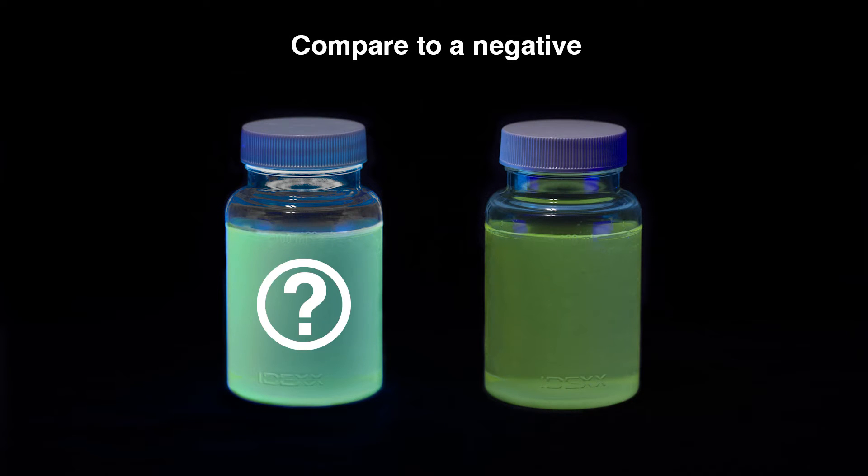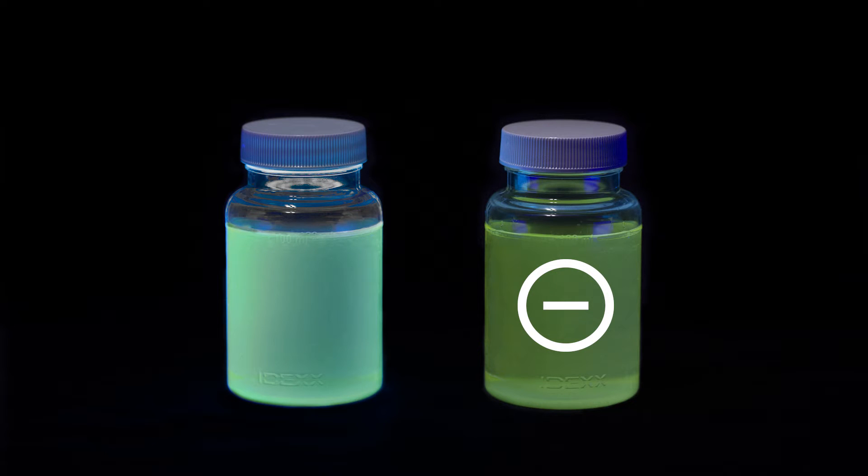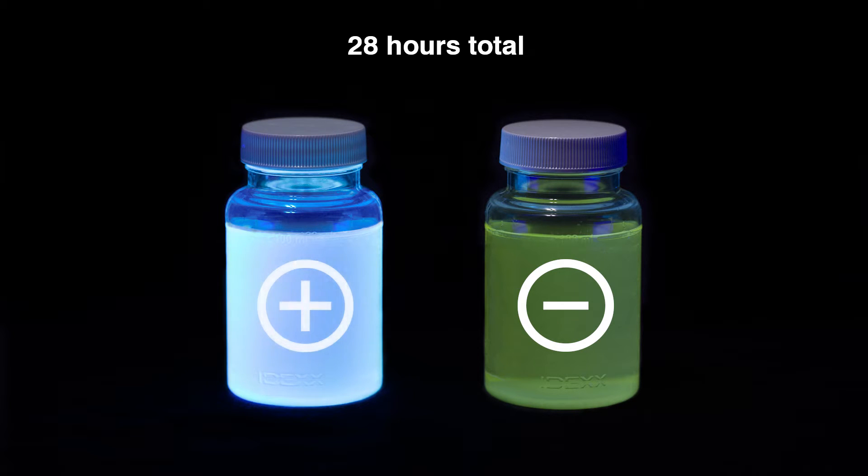If you're unsure whether a result is positive, compare the sample with a known negative. However, if the results are ambiguous based on the initial reading, incubate up to an additional 4 hours, but not to exceed 28 hours total, to allow the fluorescence to intensify.